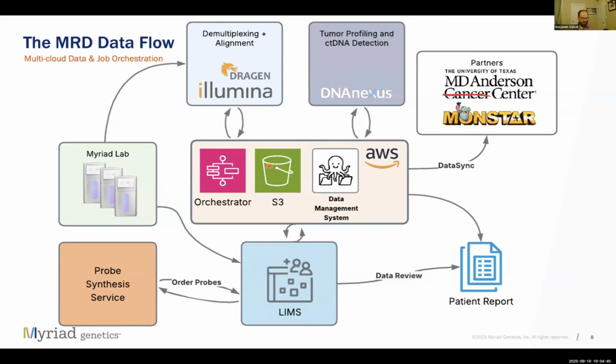Next, our orchestrator takes control. The first analysis is demultiplexing in ICA. This is recovering the individual samples from the flow cell where the samples were combined. The orchestrator starts and monitors the job on ICA utilizing Illumina's BCL Convert software, and this updates the LIMS and the data management system as that process goes on.